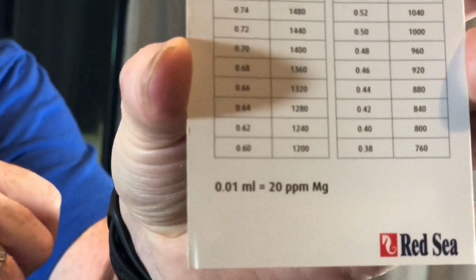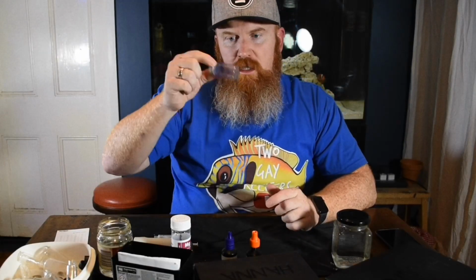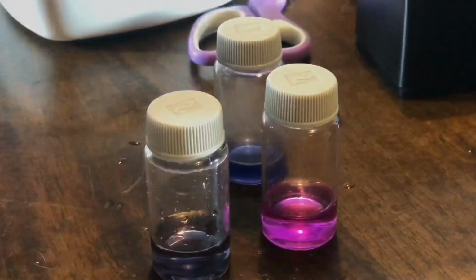Our magnesium is sitting at 1200. So Darren, can you record 1200, please? Now, I always make sure I put the lid back on the vial when I put it over to one side, just in case something happens and you knock it over.